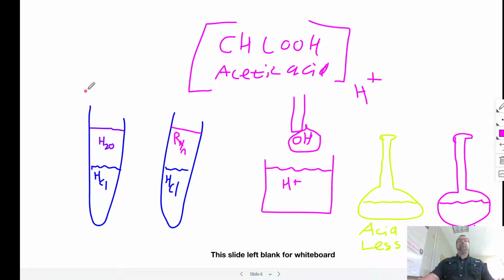And what we did first was we did this for our first test tube, and our first test tube let us know how much acid we had, okay? So our first test tube tells us how much of the hydrochloric acid, and then our second test tube, we had to titrate out all of our HCl, and then the additional acid that we had from the reaction that went on, okay? So that means that we can go ahead and see how much base it required to neutralize our acetic acid, okay?